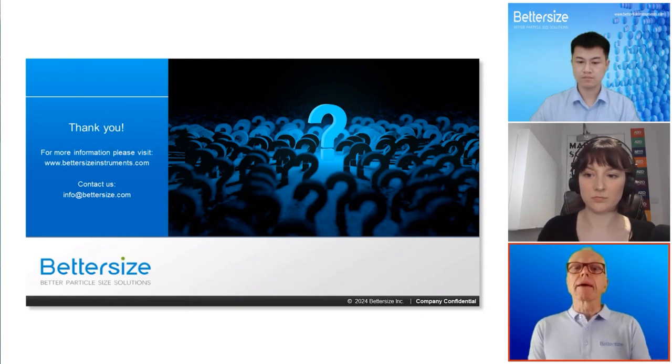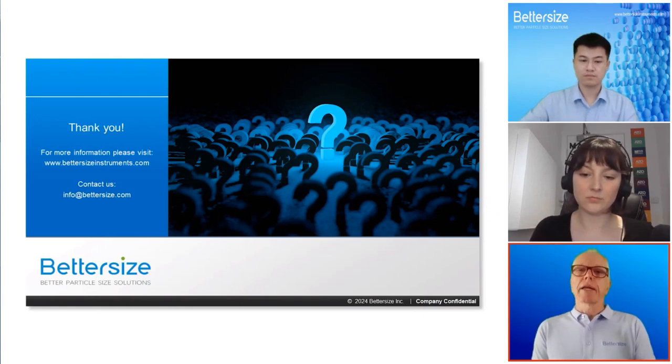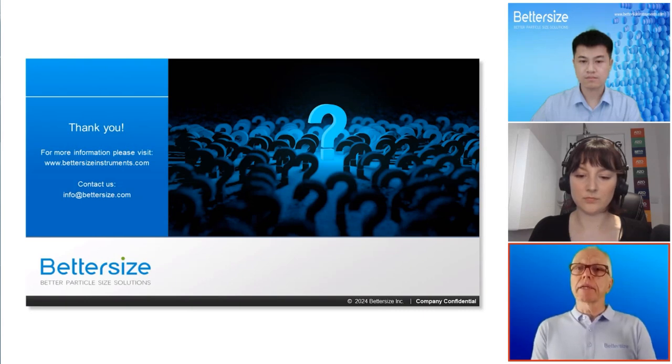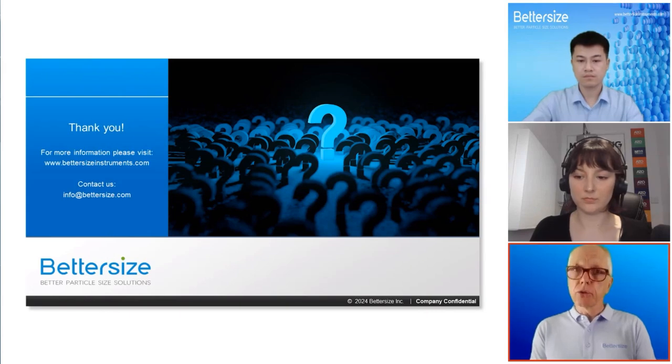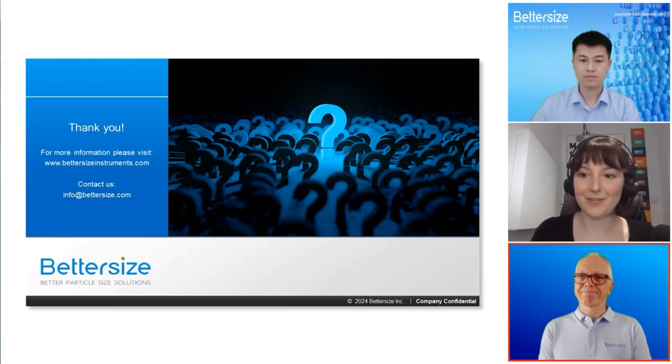What's important there is that you would develop a method and you have to very precisely define the instrument that you're using, the sample preparation details, the instrument's method that you followed, all the parameters that you entered into the instrument, and so on. And if you specify those things, you can still very usefully use dynamic light scattering, even for complex and highly polydispersed samples. Fabulous, thank you.